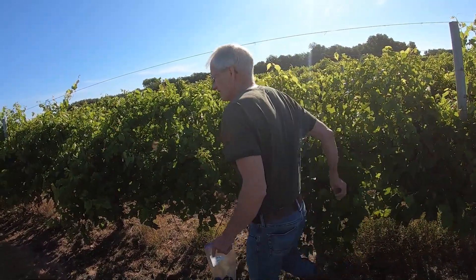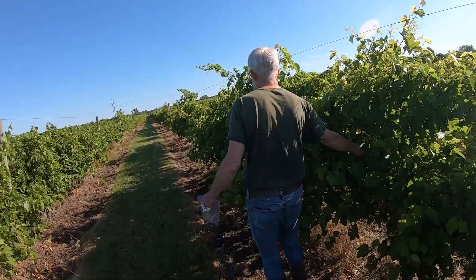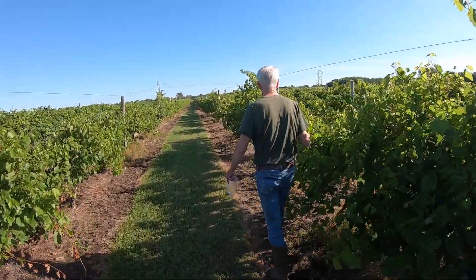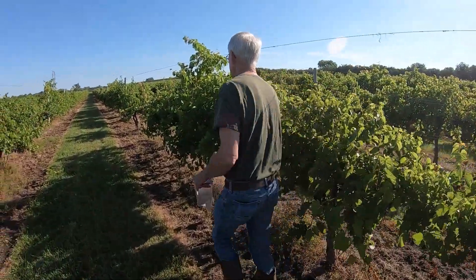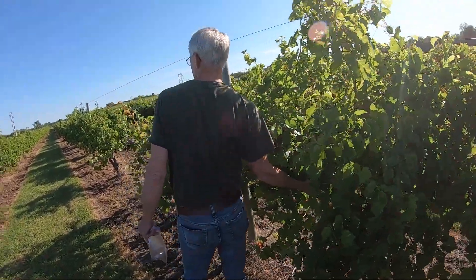Some people may do field sampling different ways, but that's how we've always done it and how we were taught. We'll get these samples back to the winery and run those two tests to see where we're at.